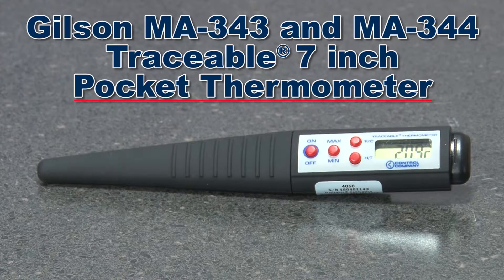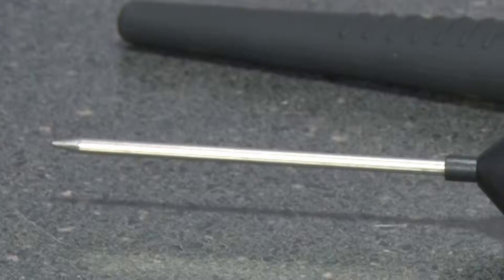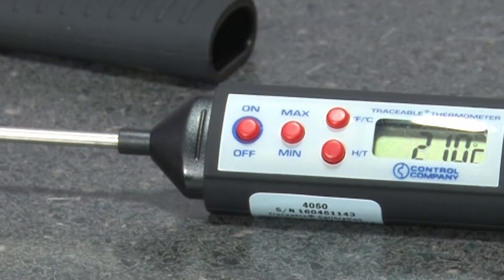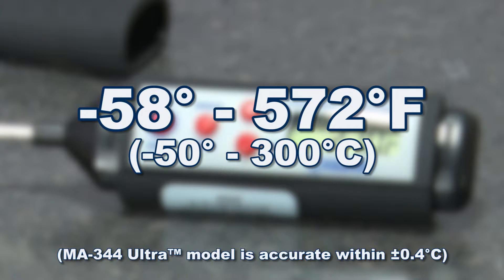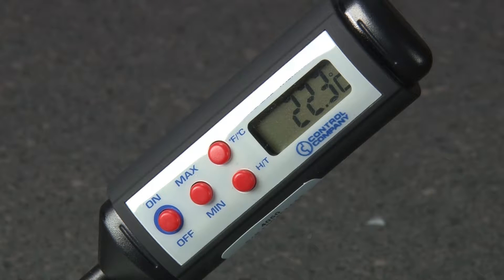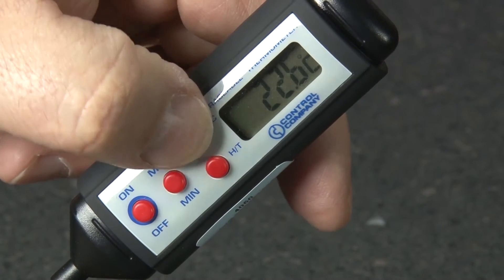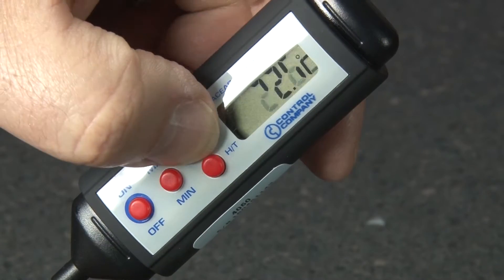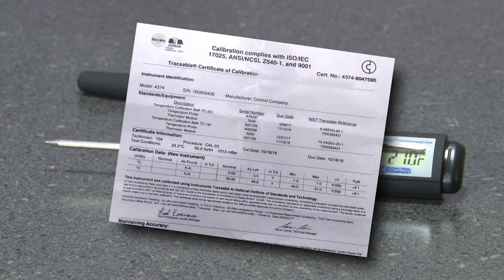Gilson's traceable 7-inch pocket thermometer has a flat profile design with stainless steel and plastic construction. The MA343 and the MA344 have a temperature range of minus 58 to 572 degrees Fahrenheit. Both models have a maximum minimum temperature recall function. The large LCD display is easy to read and easily switches from Fahrenheit to Celsius. Each unit is serial numbered and comes with an NIST traceable certificate.